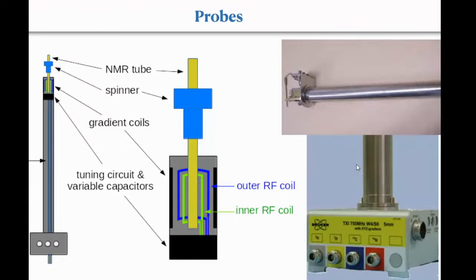So this NMR is just like a radio, right? A radio, this is 93.5 FM, this is 108 Anandapuri FM, and this would be I think 94.7 Big FM. So all these have different frequencies, and you have to go into that frequency in order to observe it. Doing proton, you will not be able to see carbon 13. I mean, pulsing on proton or detecting on proton, carbon 13 signals will not come. Okay, so it is not going to be able to see carbon 13 signal, right?